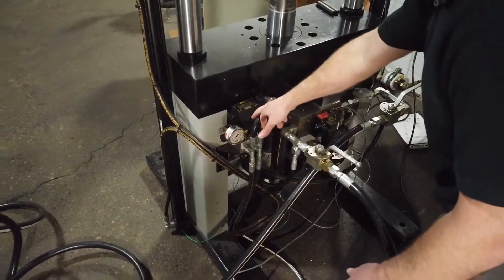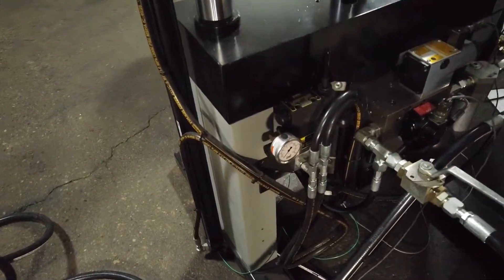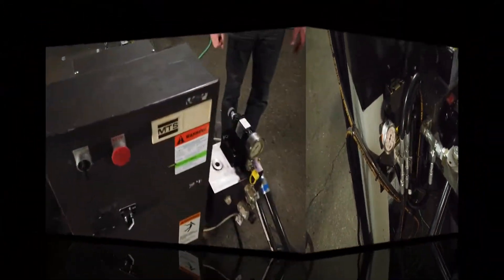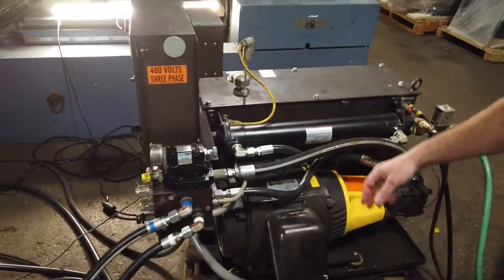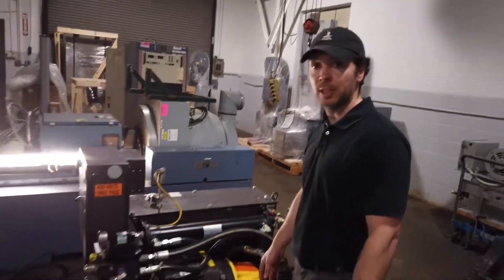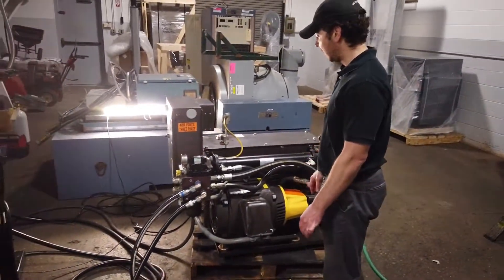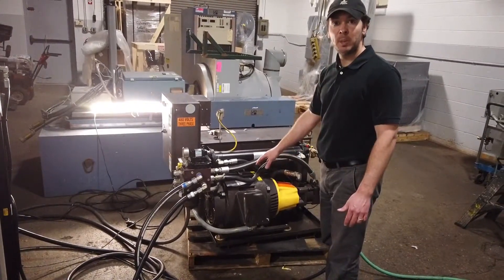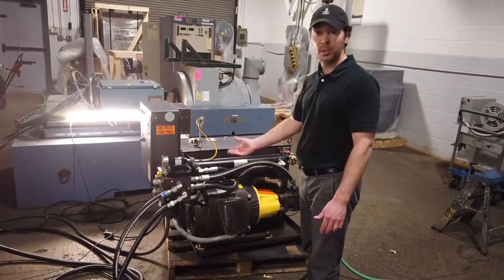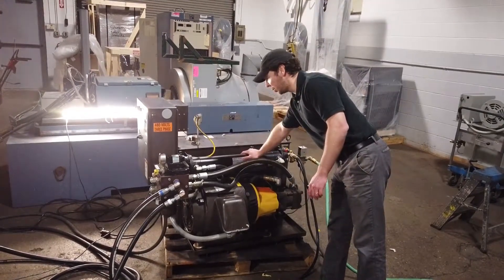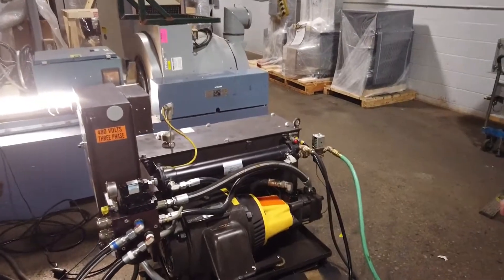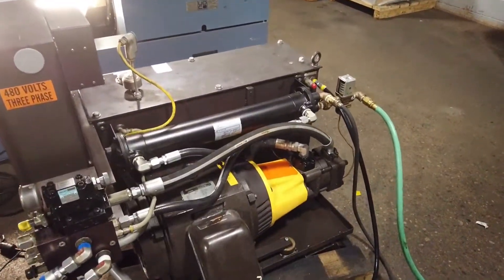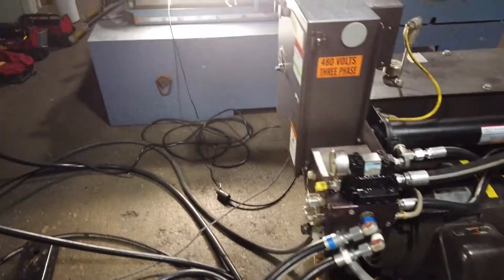As well as our Parker lift system which controls the hydraulic lift cylinders. Providing hydraulic power to the system is an MTS 510.10 hydraulic power supply that's been reconditioned by the Frank Bacon team. It has 10 GPM of max flow at 3000 PSI. It's got a new water-cooled heat exchanger system, and it runs beautifully, nice and quiet.